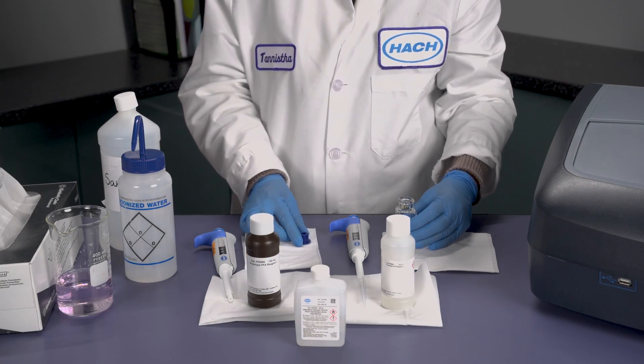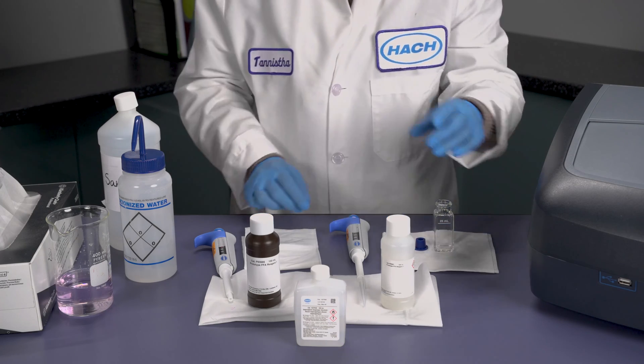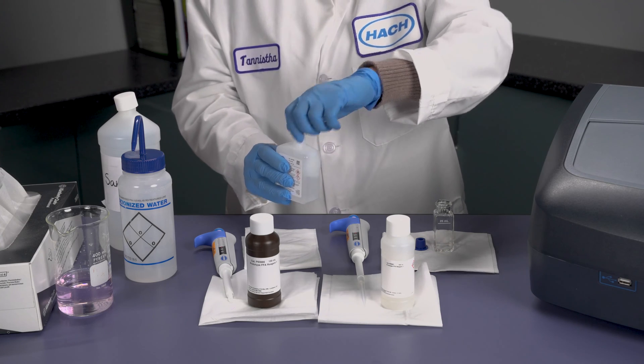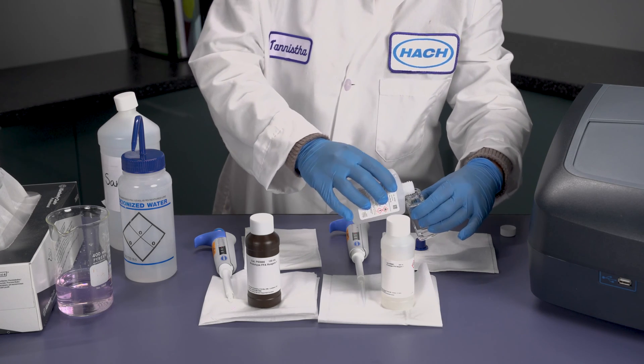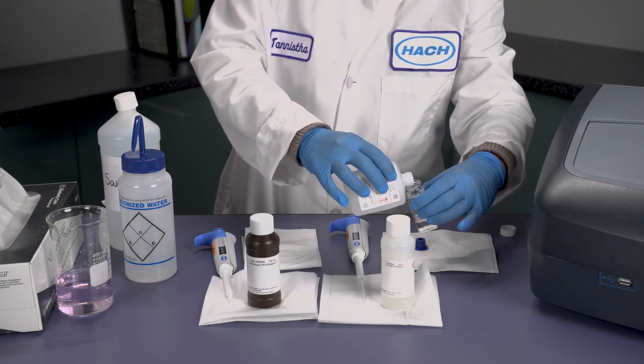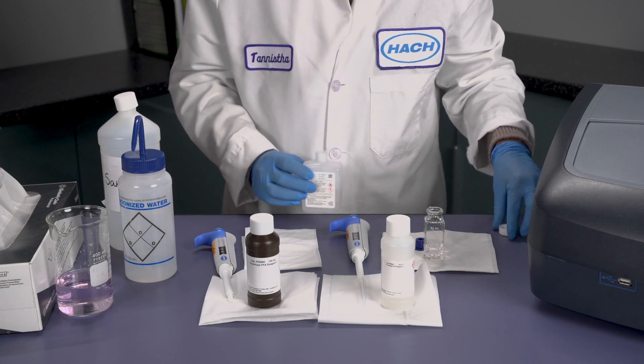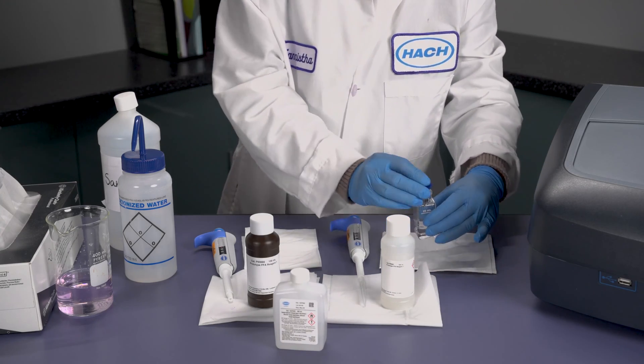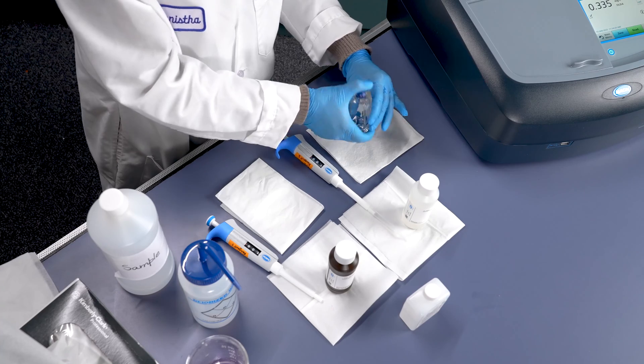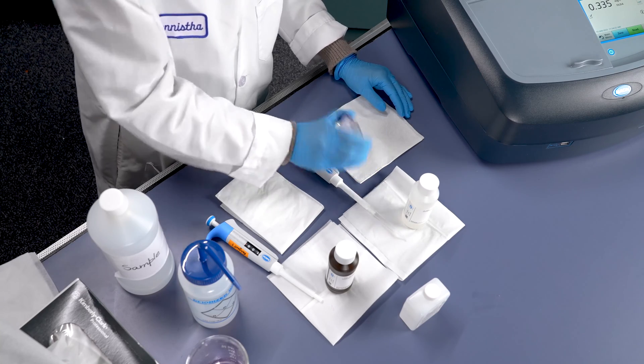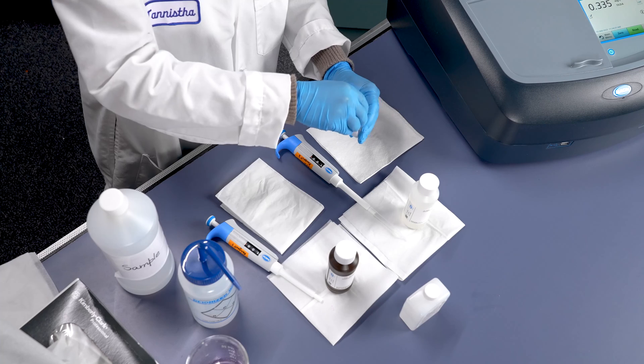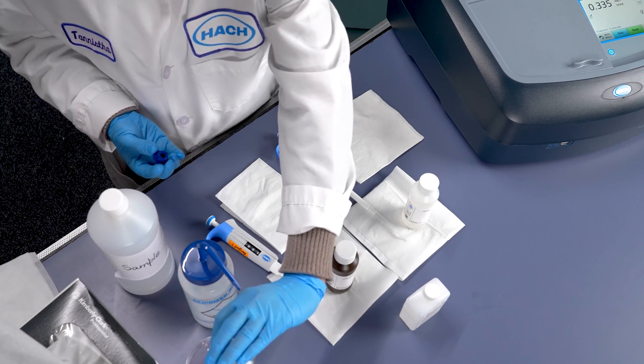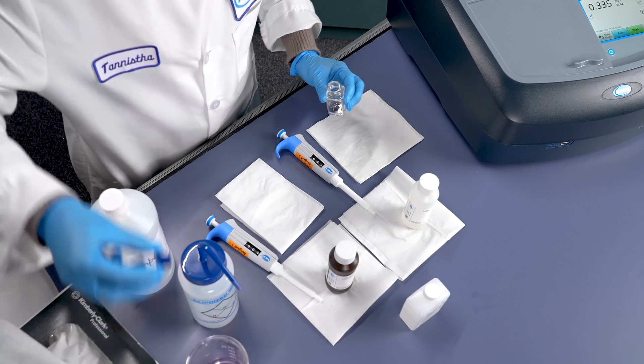After rinsing with deionized water, you now want to add isopropyl alcohol to the sample cell. Add about one-fourth of the volume of the sample cell with the isopropyl alcohol. Again, place on the stopper and shake vigorously.